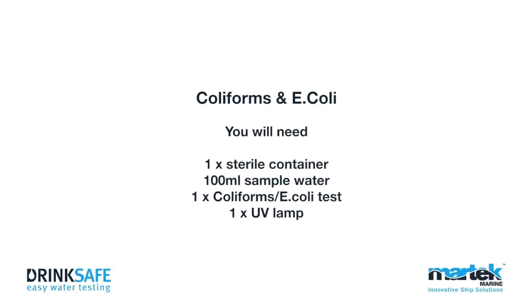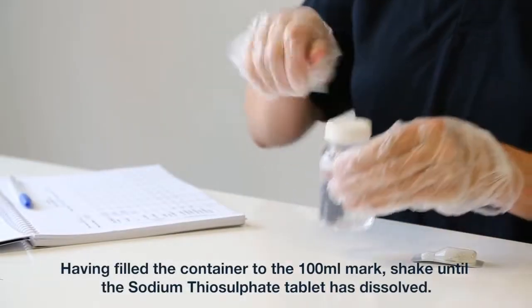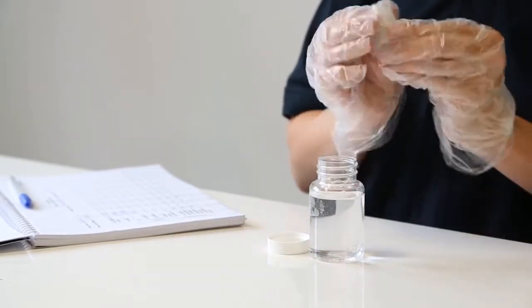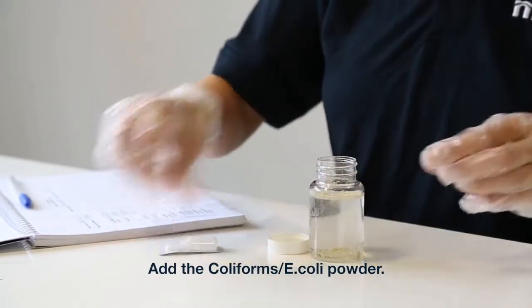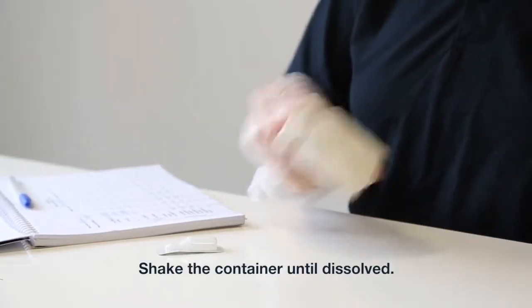Coliforms and E. coli. You will need 1 sterile container, 100ml sample water, 1 coliforms E. coli test, and 1 UV lamp. Having filled the container to the 100ml mark, shake until the sodium thiosulfate tablet has dissolved. Add the coliforms E. coli powder. Shake the container until dissolved.